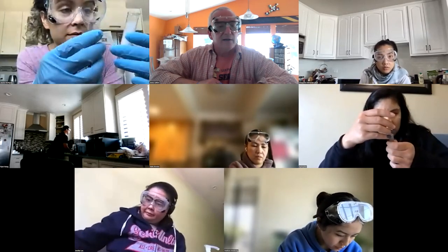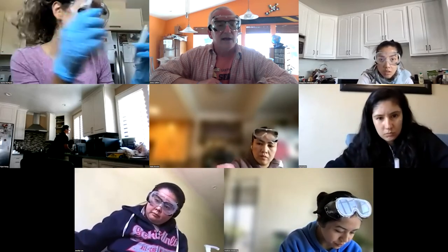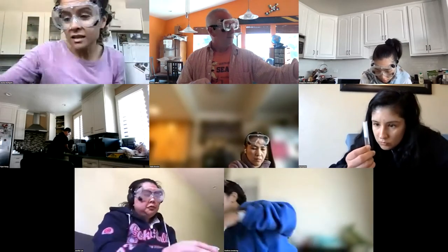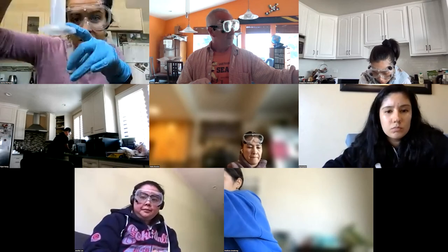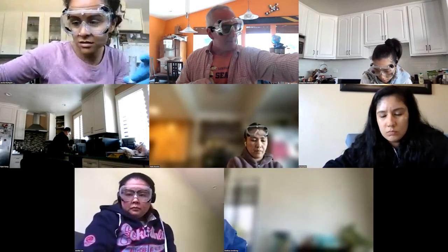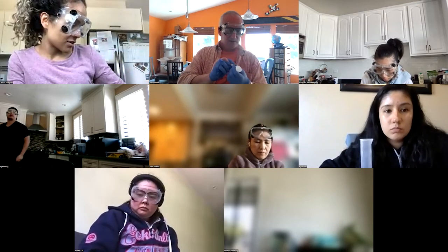I'm surprised how much, and it didn't mix much, because you can see it at the bottom of the cylinder. That may be one problem: I don't think all of it went into solution. So that could be why the water's not as hard as we would like it.